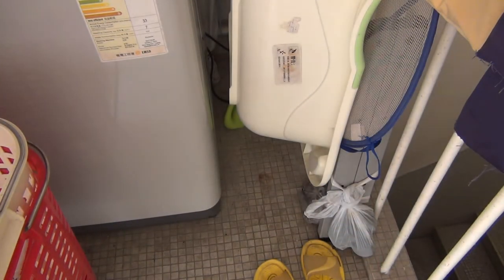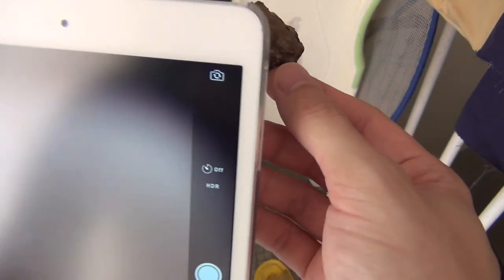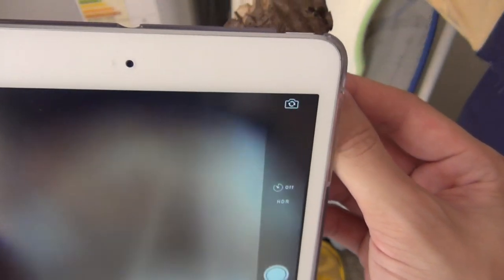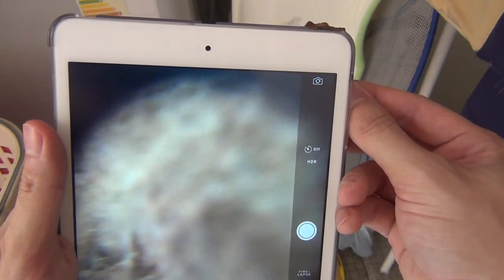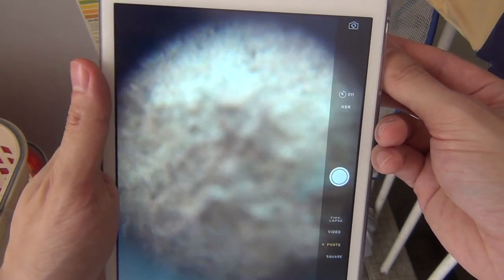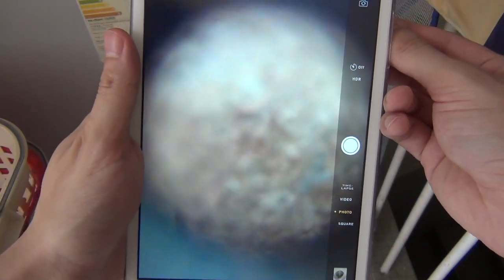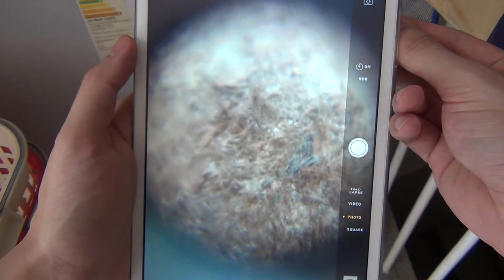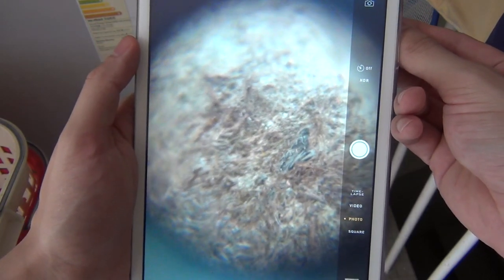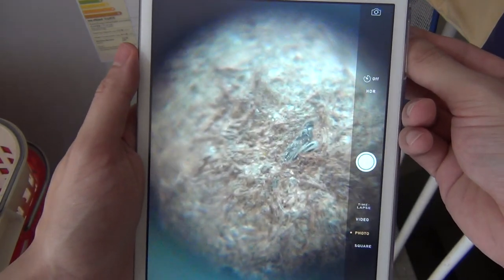Now let's see what happens if I take out one lens. With only one lens, the view is less macro, but it's easier to work with, because now the object doesn't have to be touching the lens. It's a lot easier to work with — I can still see the structure of the paper. Sometimes you have to fight with the autofocus of the iPad, so you have to position the object at just the right distance to get focus, otherwise the iPad will struggle.